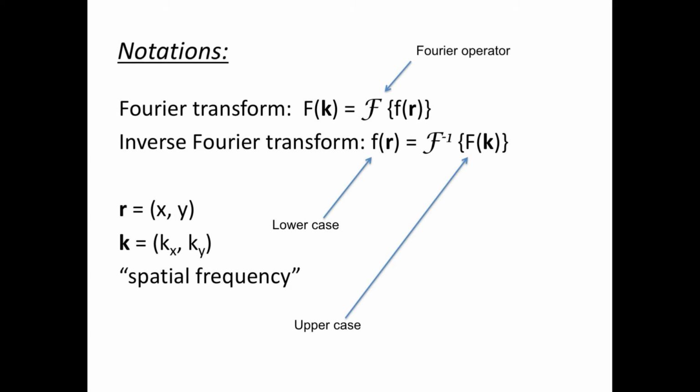Okay, I'm going to use the following notations. Fourier transform is this twiggle kind of operator on this real space function. And there's always a capital and a small one here. The real space function is always small, and the Fourier one is large. Inverse Fourier transformation would be an F to the -1 of this function.